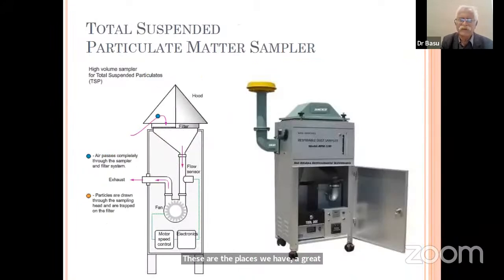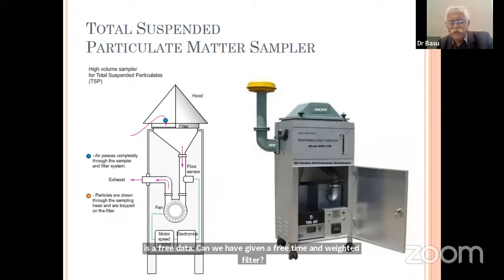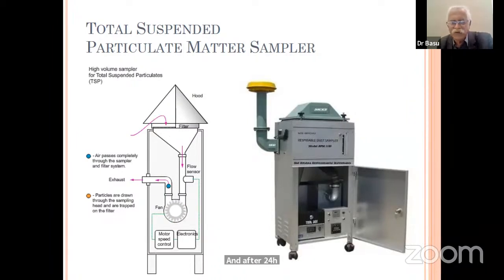Now, how is this air monitored? Look, here it is coming in. This air is entering and then coming out. Here we have given a filter, and the filter is a weighed filter. After 24 hours, or 8 hours, we take out the filter and weigh it. The difference in weight is the particulate matter.